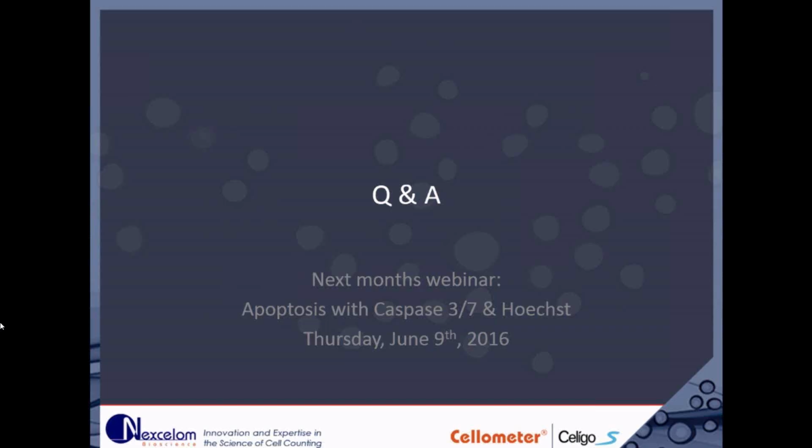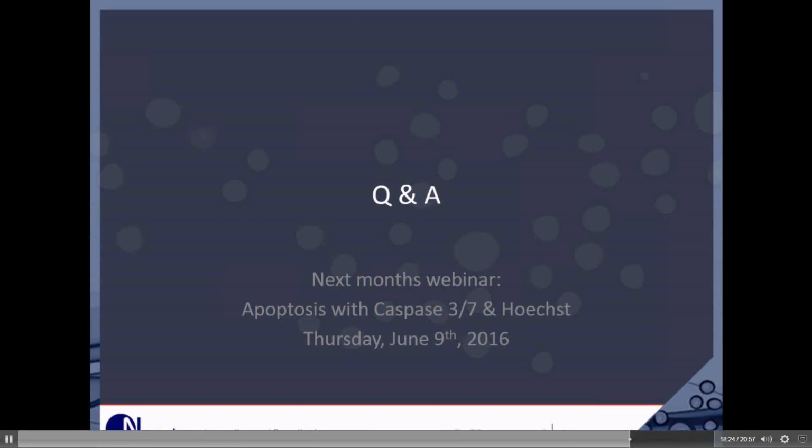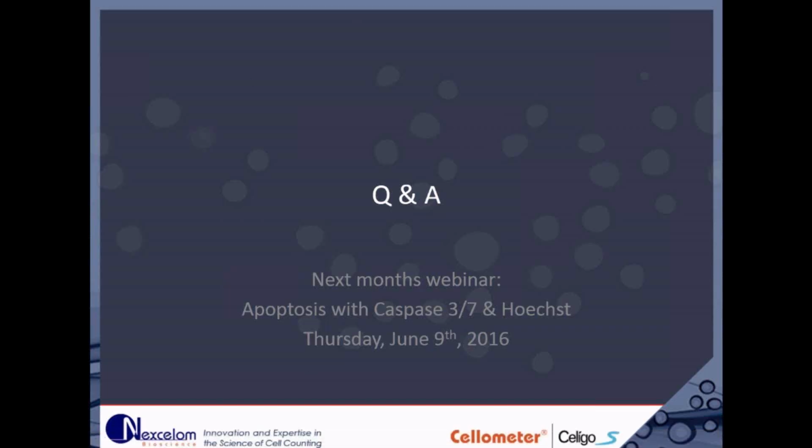Thank you, Sarah. We do have some questions. All right, so your first question today is, what is the difference between focus setup, register auto, and find focus?